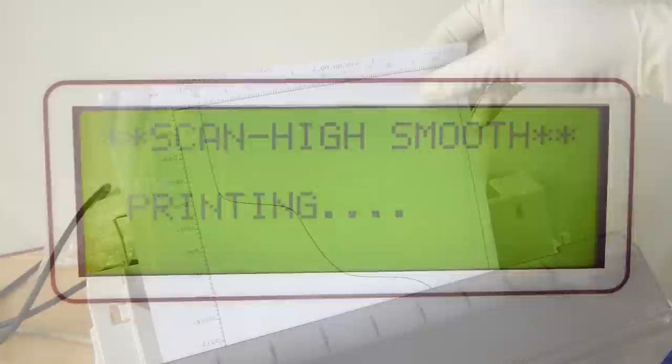From the printed results, we get the half wave potential and average limiting diffusion current of cadmium and zinc ions in the given mixture.